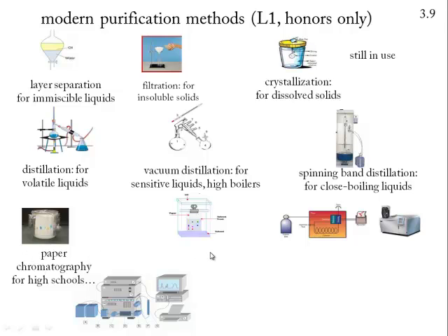Usually they're going to use a different solid support. Typically they'll use silica gel, which is purified glass on a solid backing, and you elute some solvent, and they separate based on their adhesion to that solid phase. So this is known as thin layer chromatography, and that's a great method for separating out small amounts of solids. You can literally take a mixture and scrape off each solid.